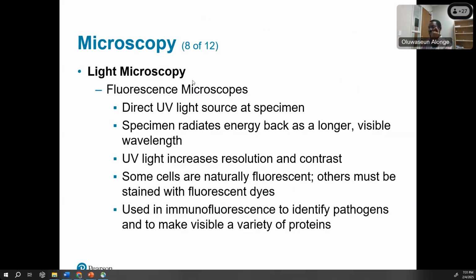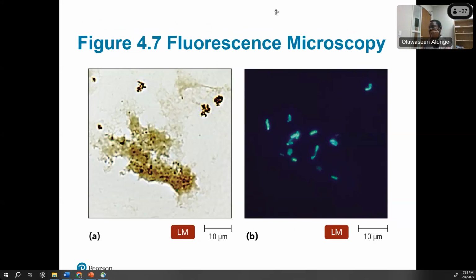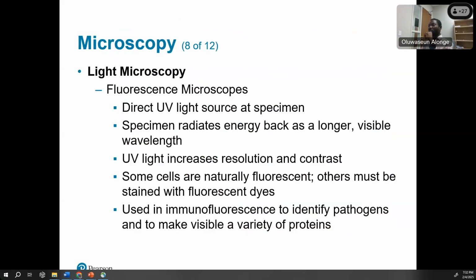Now, there is the fluorescence microscope. Think about fluorescence as light. When you see something with fluorescence, it's like light glowing on an image.